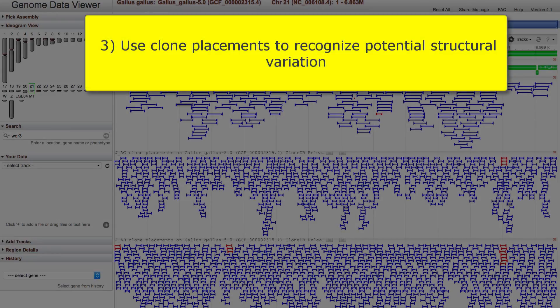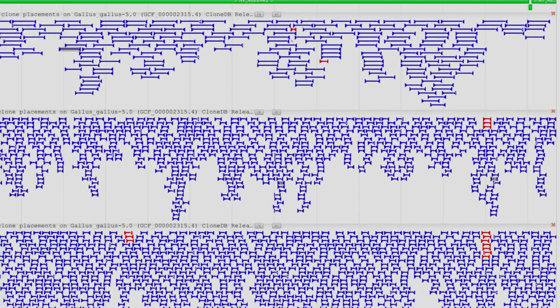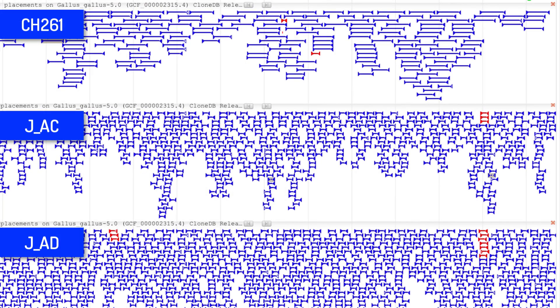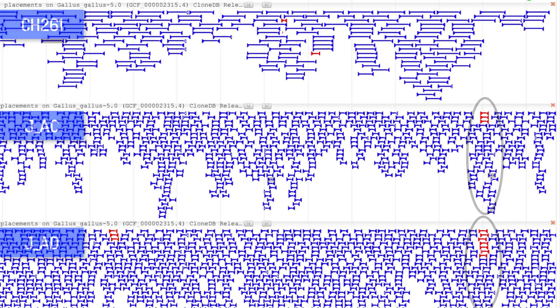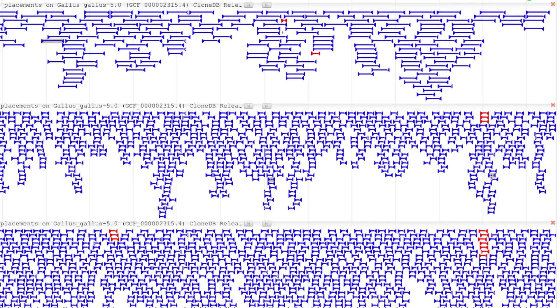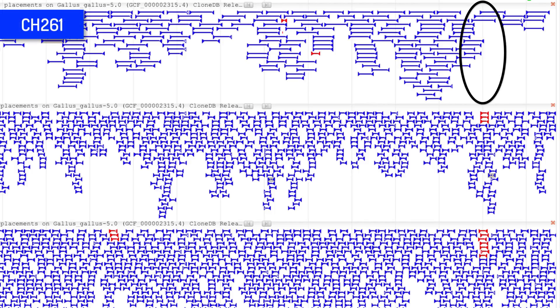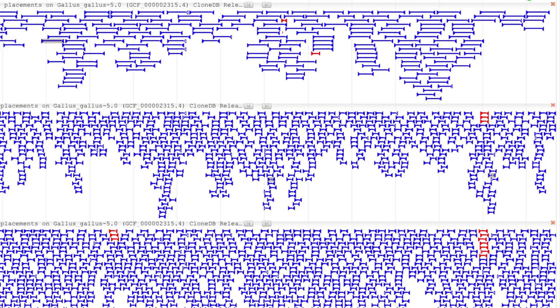In the final example, we look at clone placements that indicate possible structural variation. I've moved over to chromosome 21, and here we see a few smaller regions in the JAC and JAD libraries with placement of both concordant and discordant clones. This mixture is an indication of structural variation. Notice that the end clones from the CH261 library have only concordant placements in these regions. Remember that the source sequence for CH261 is different from the other two libraries, leaving open the possibility of genomic variation in these regions.